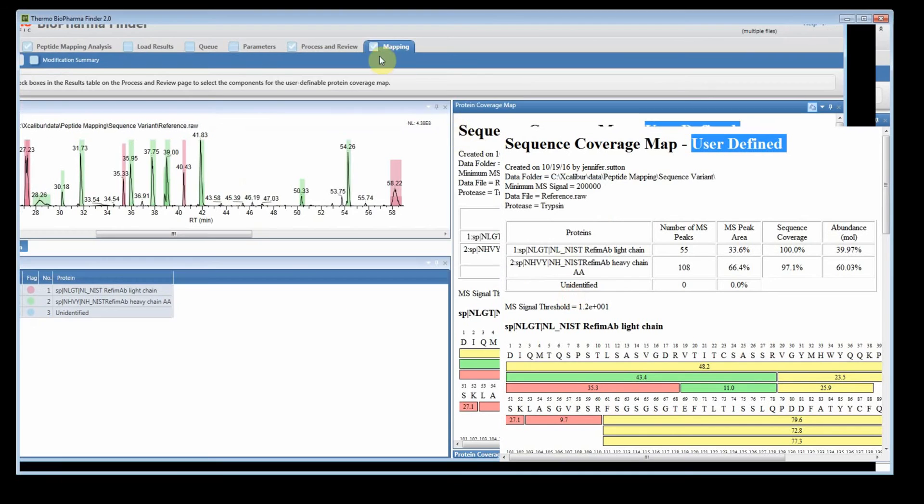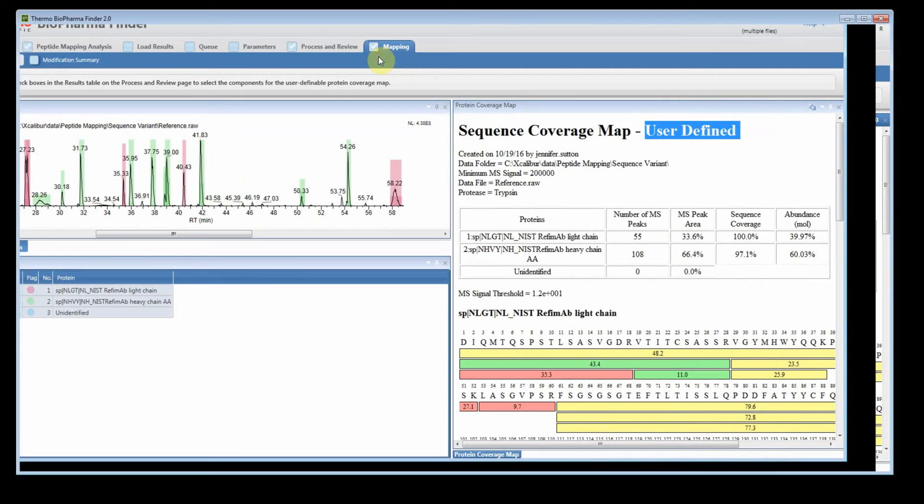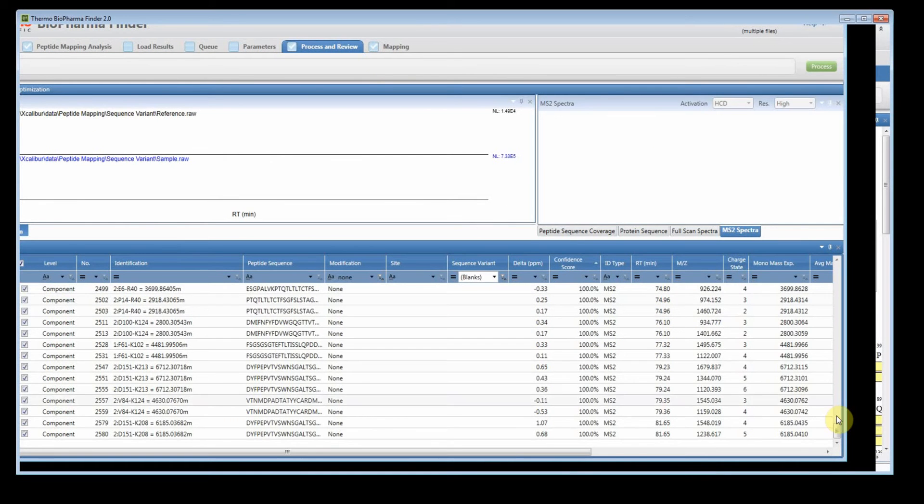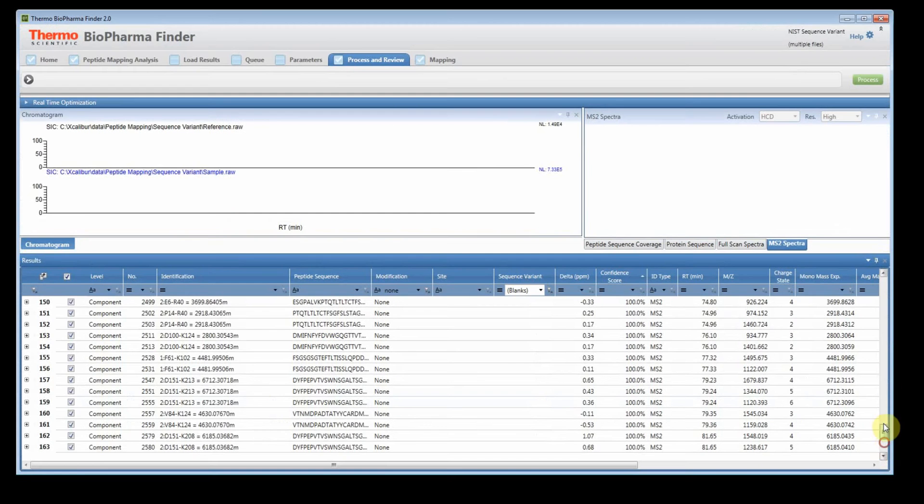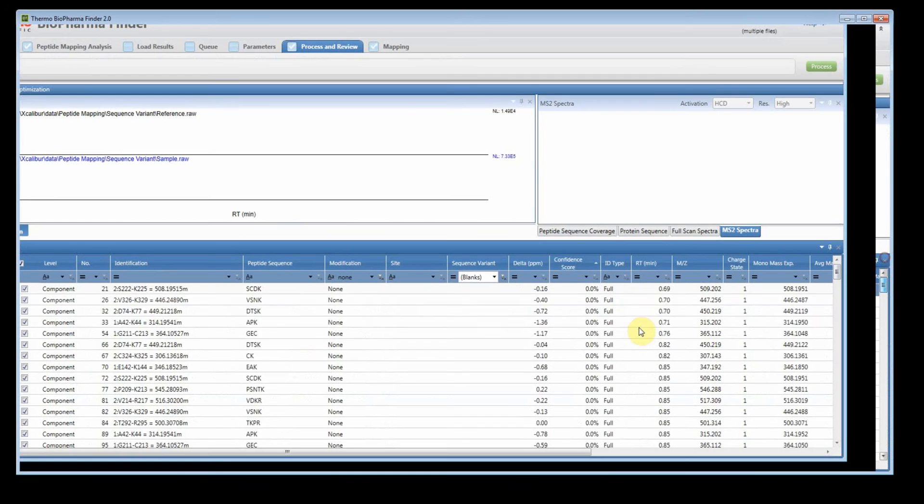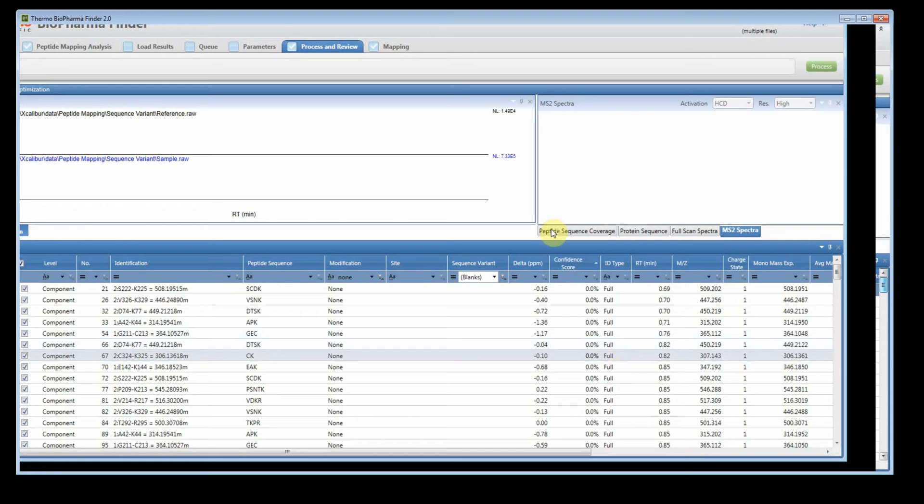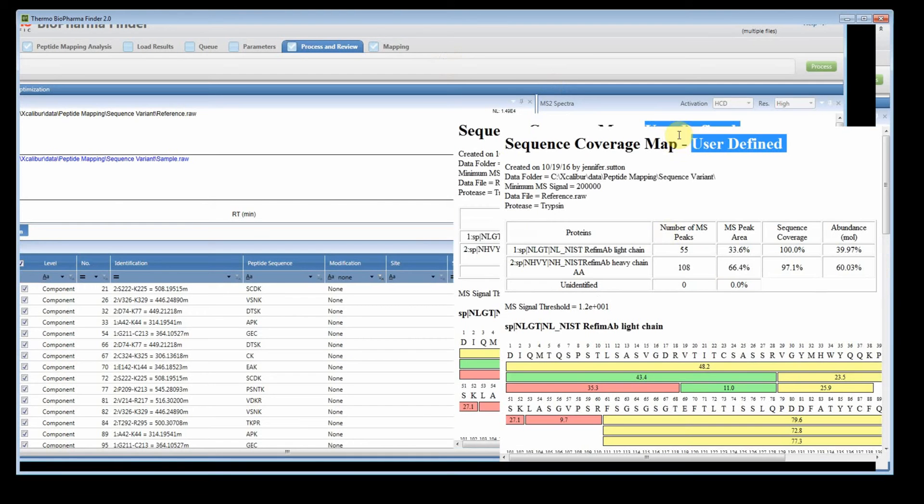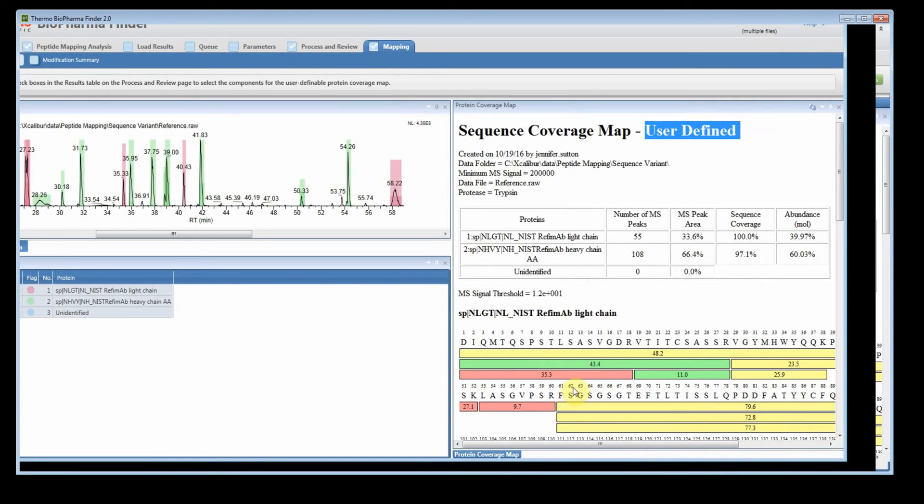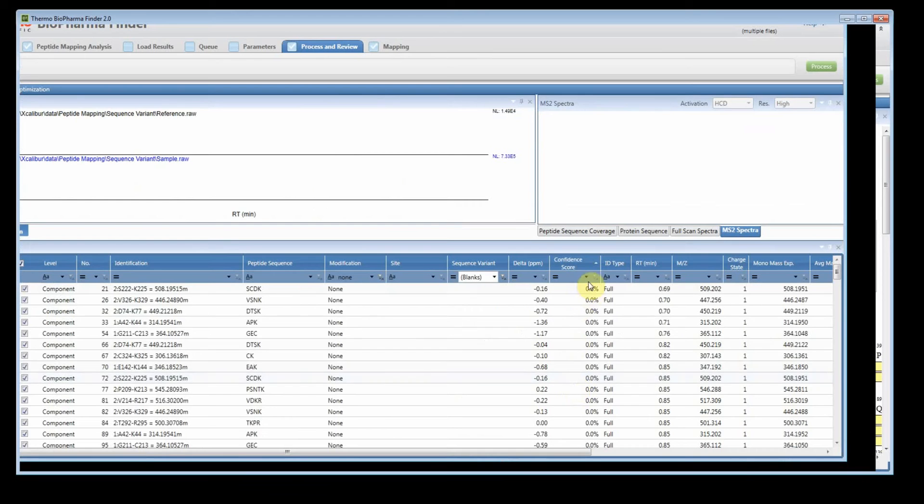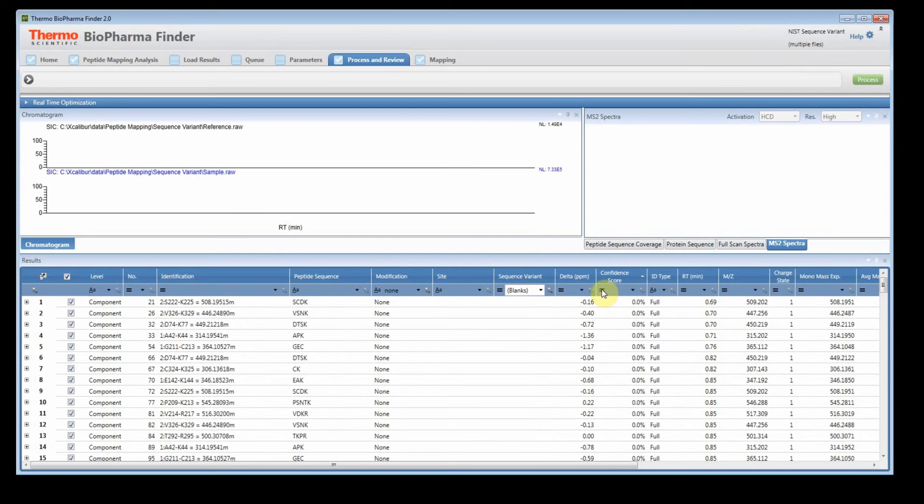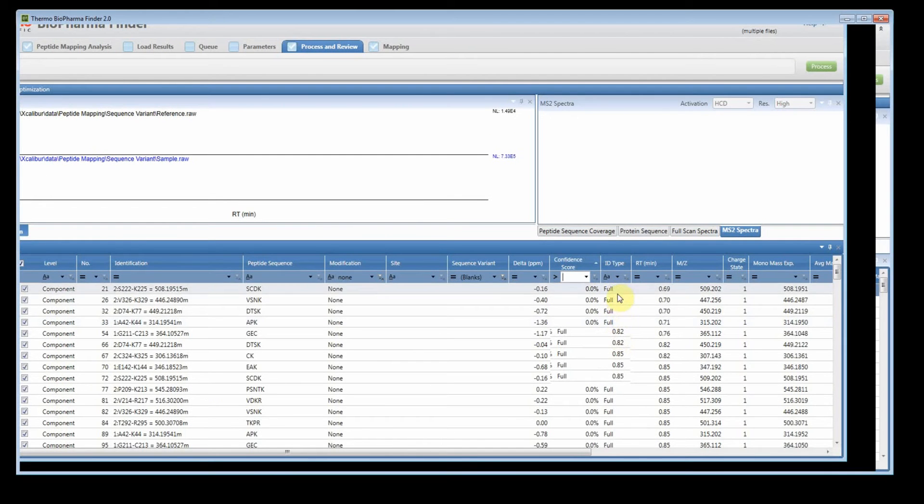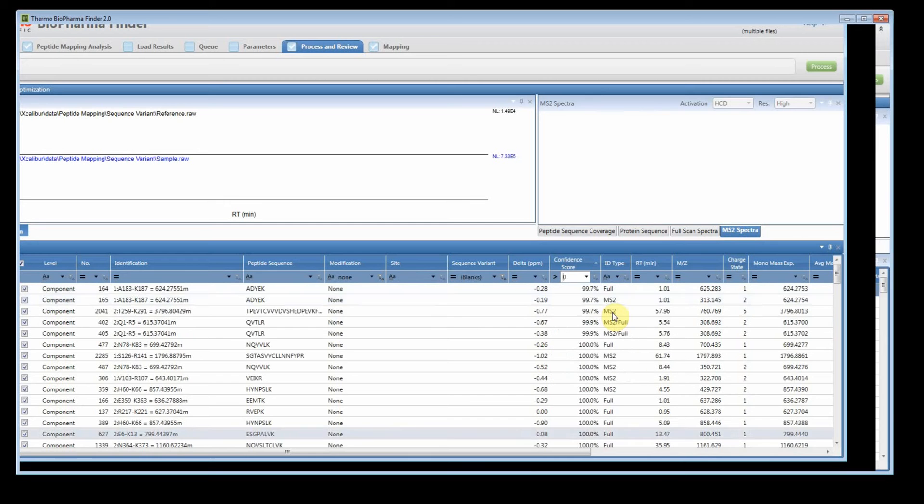So what that means is if we go back and we actually look, when we check it this way, we are allowing full scans with 0% confidence score to be on your coverage map. So that's why we're getting better coverage when we actually select that. So if I go back and exclude those, the way I can do that would be it has to be greater than, I'll say, 0.